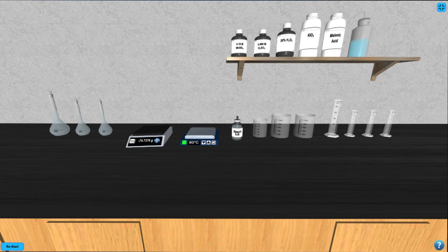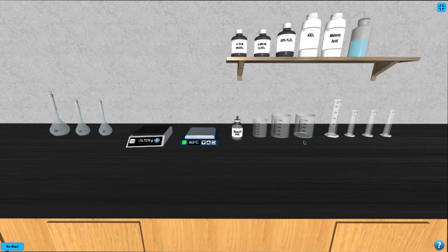Now you're ready to perform your reaction. Click on the starch indicator bottle on the benchtop to select the dropper. Then click on the final 100 milliliter beaker to move the dropper over that beaker. Click on the dropper until it is empty and returns itself to the bottle. Next, click on the first volumetric flask to add 10 milliliters to graduated cylinder 1.